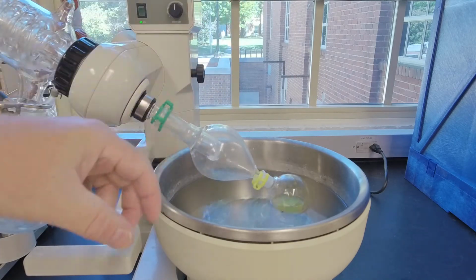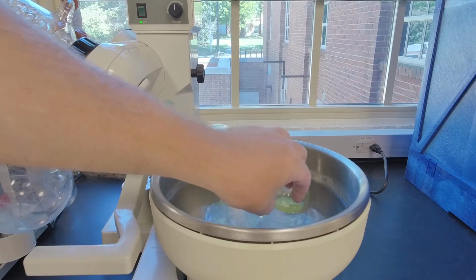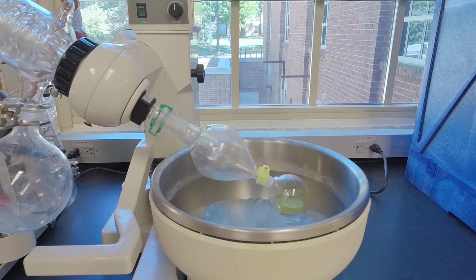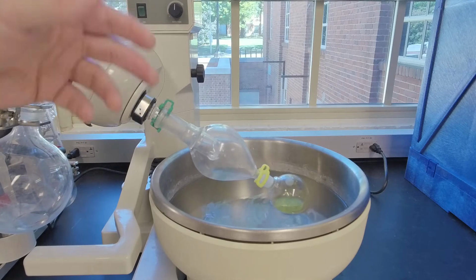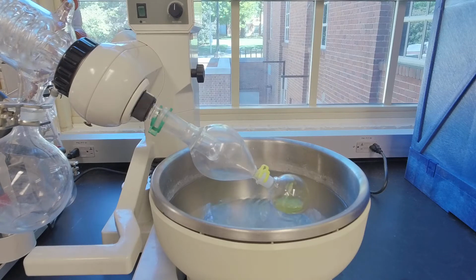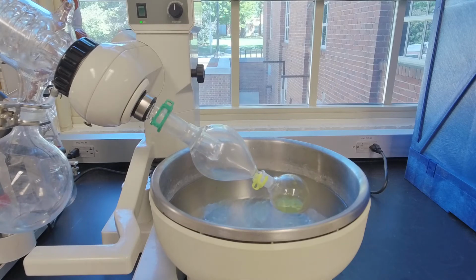If this were dichloromethane, though, the boiling point's like 35 degrees C, so it's going to boil super fast. It may explosively boil, and if it does, this trap here will trap it, right? If it boils vigorously, it'll land here and just fall right back down. And that keeps us from losing our material, right? If it bumps, and you almost have to see a bump to know what that means, it's not boiling, so it's going to carry the material you want. We're trying to isolate that yellow stuff. So if it bumps and goes all the way up to here, over to the collection flask, then you're just going to lose your material. So that bump trap's important.